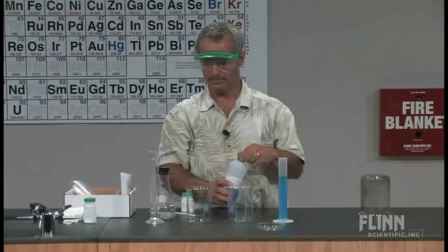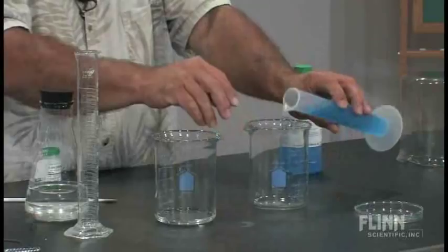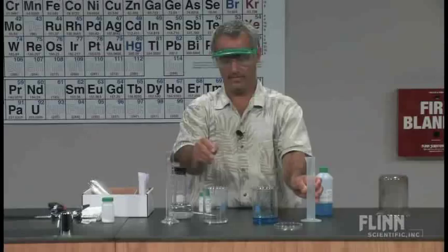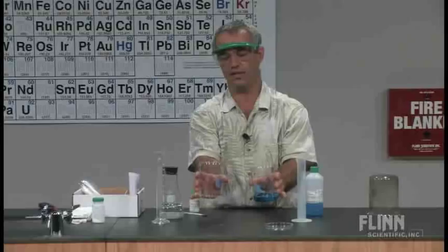We'll transfer those into the beakers here. There's my calcium acetate solution. Here's my ethanol. Okay, and this transfer should be done pretty quickly. I like pouring the ethanol quickly into the calcium acetate. That's why I pour it in these larger beakers. So, here we go.